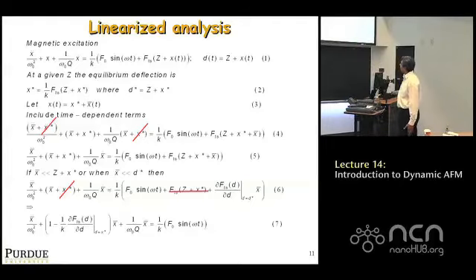And you can simplify life a little more also by looking at the right-hand side. You remember the right-hand side has FTS, right? Now, FTS is a function of D. D is Z plus X, but X is now this equilibrium X star plus the perturbation on it. So FTS is FTS of Z plus X star plus this time-dependent perturbation.